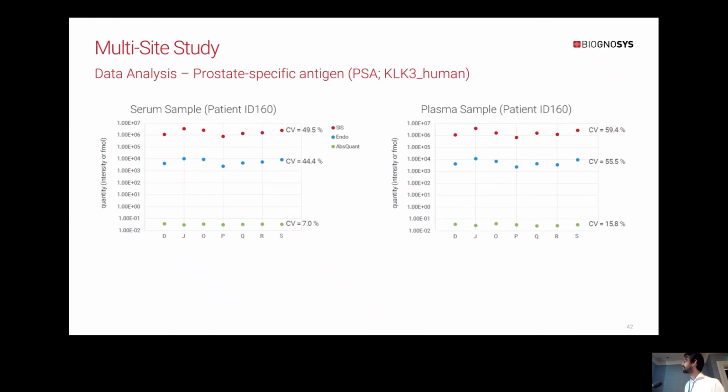So what you can see here is across the 7 systems, now in one patient, the quantification that the light channels, they are actually varying a lot. And I have to say, in this case, it was independent analysis of the light intensity. So in a discovery setting, you would normalize and then get some of this variation out. But here it's just the raw light intensity. And actually nicely, the heavy peptide synthesis is quite abundant and the target is very low abundant, but still we capture both. And in the heavy to light, in the absolute setting, this is really taken out and we can nicely quantify this fairly low abundant biomarker, the CV below 20%.